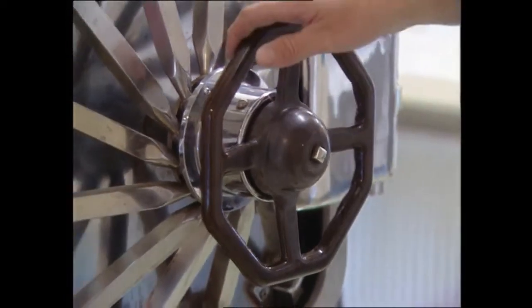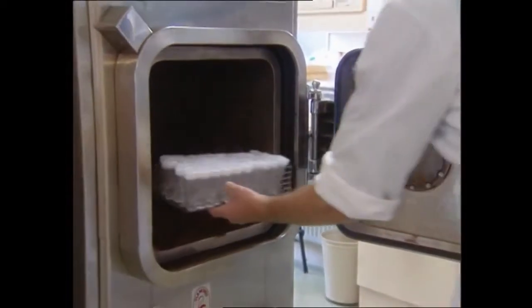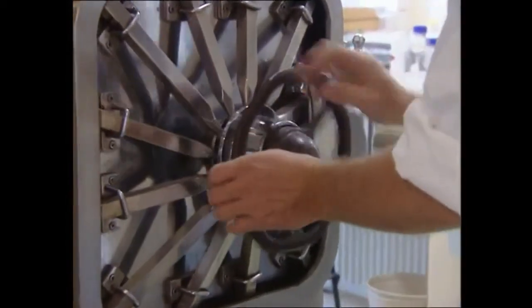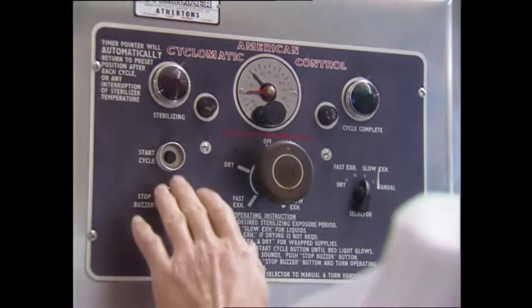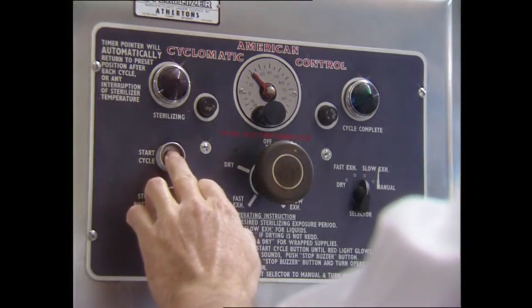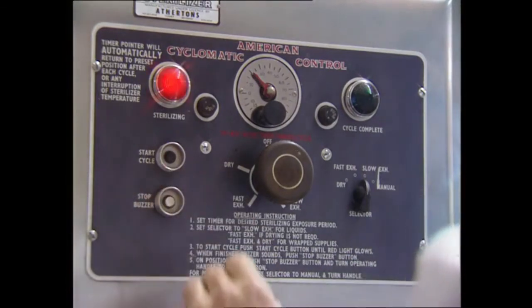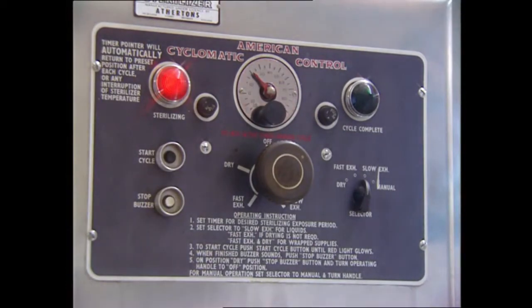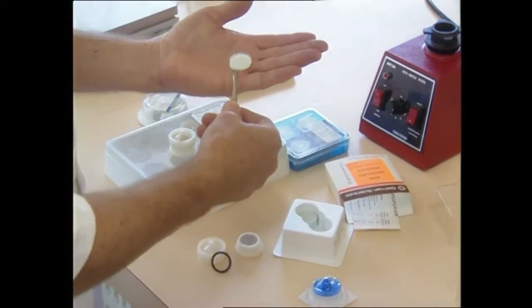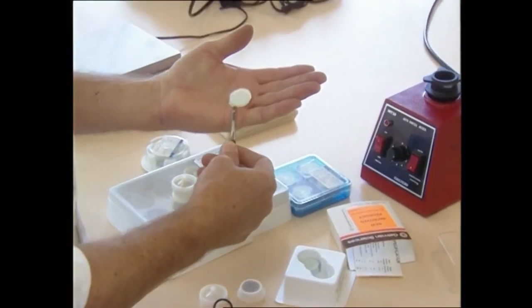For others, the culture vessels are capped and autoclaved for 20 minutes at 121 degrees centigrade at a pressure of 103 kilopascal. This pressure and heat will destroy all microorganisms which are in the medium and the culture vessels. A household pressure cooker may be used instead of an autoclave in small hobbyist operations. Another method of sterilization of media is filter sterilization.